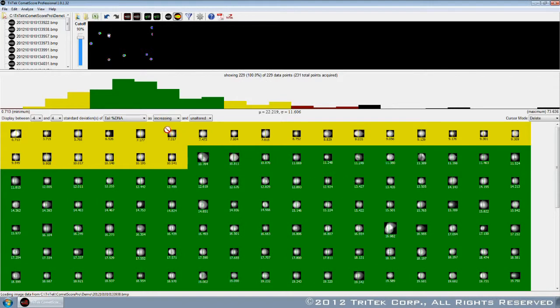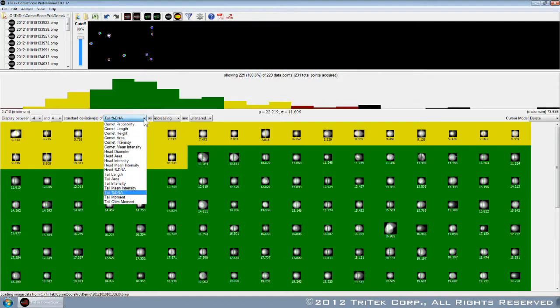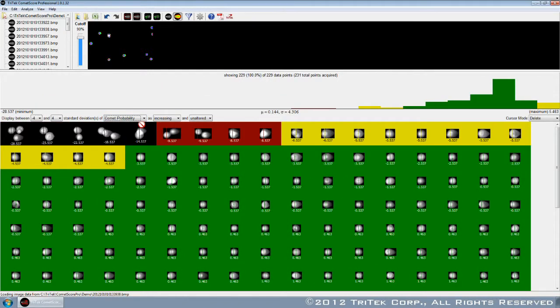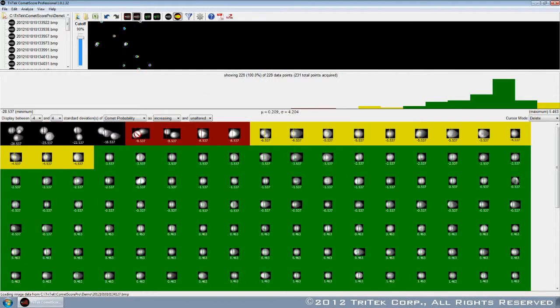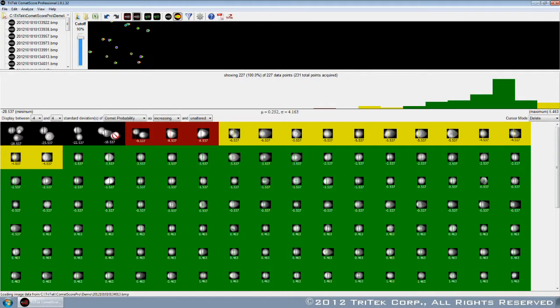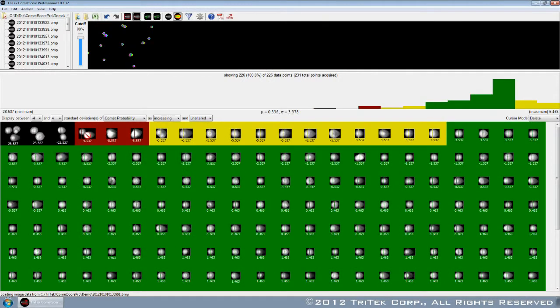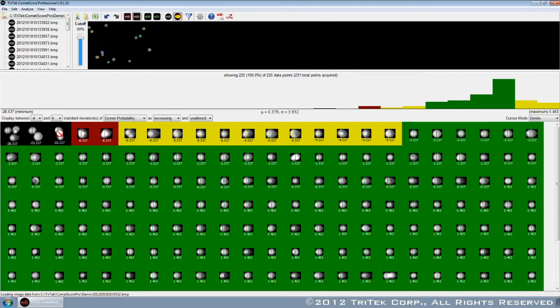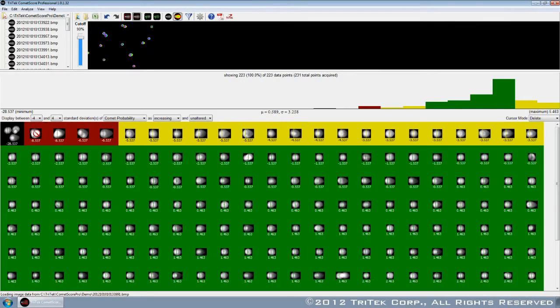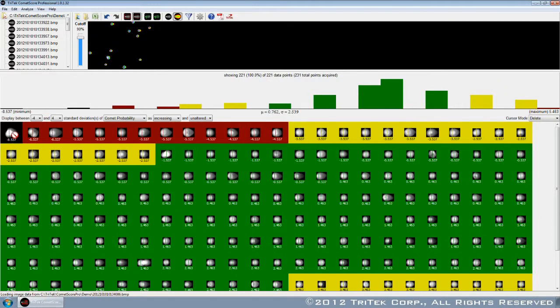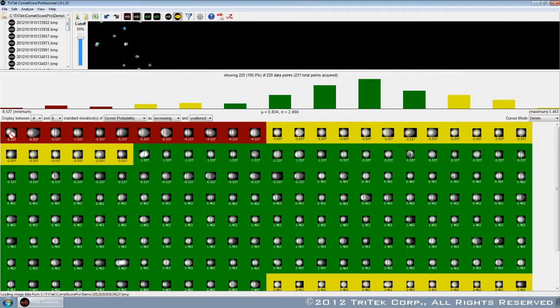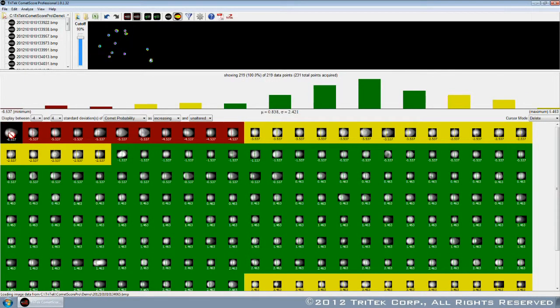Viewing the color-coded grid, you will be able to easily identify overlapping comets and debris with a single glance. Deleting these invalid data points is as simple as point-and-click.